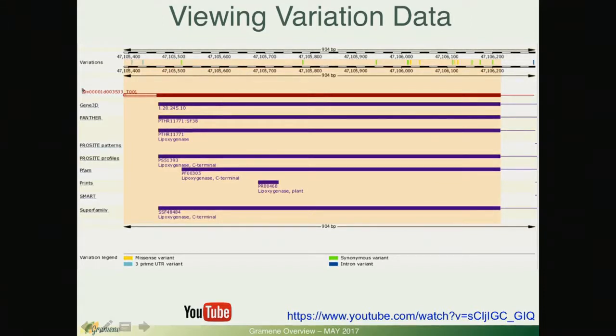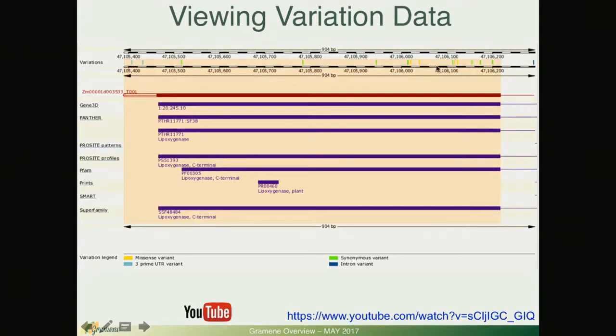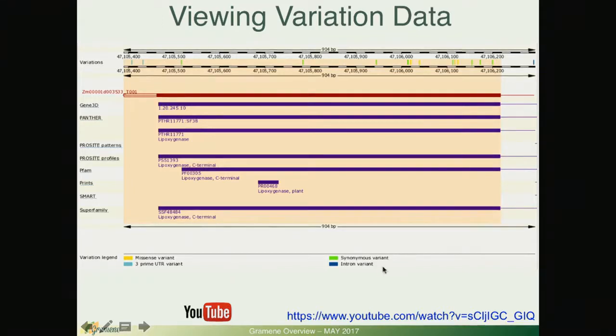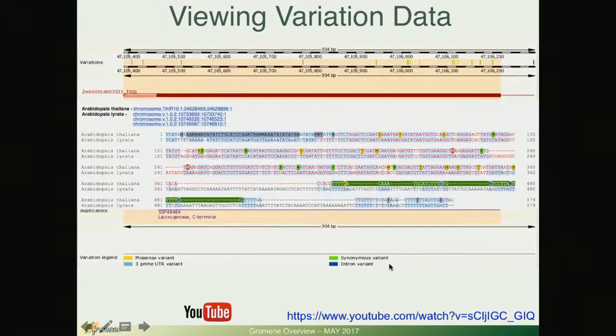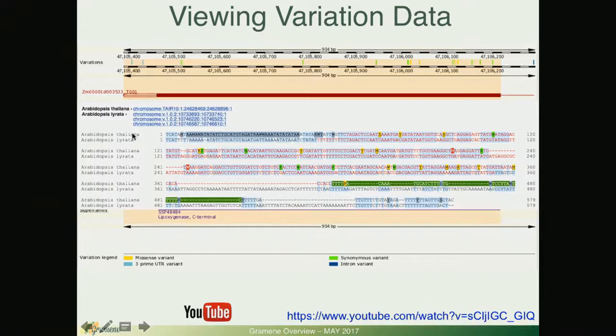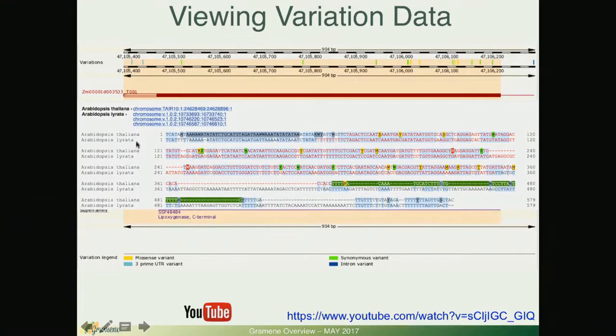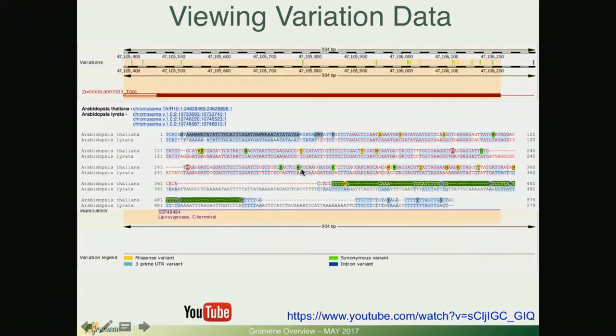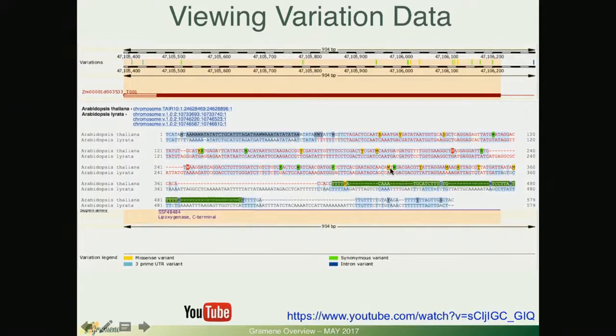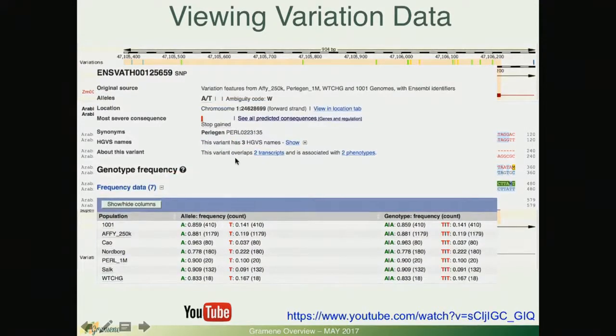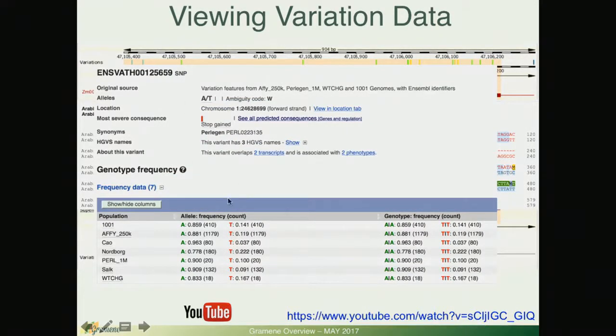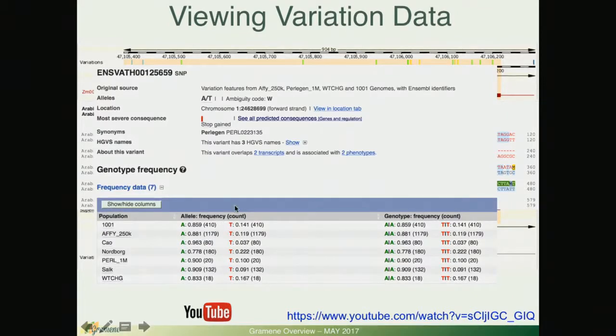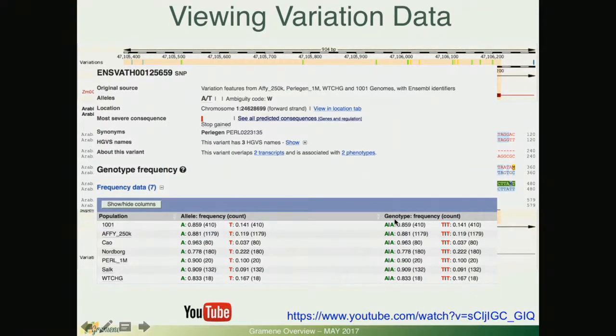A couple views of what you can expect from the variation data. You can identify variants within the context of InterPro domains. You can see the variants up here in the top line, they are color coded by their functionality. You can also in the pages see an alignment of a species alignment to see whether any particular variant is conserved in two species of interest.